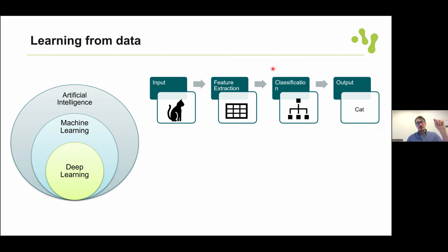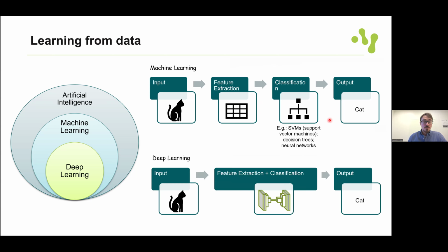And then we will label our data, and we will ask the algorithm to learn which is the best threshold for these things. In these cases, for example, we can use decision trees or support vector machines or random forests that will learn which should be the best threshold for each of these spatial filtered images we generated.